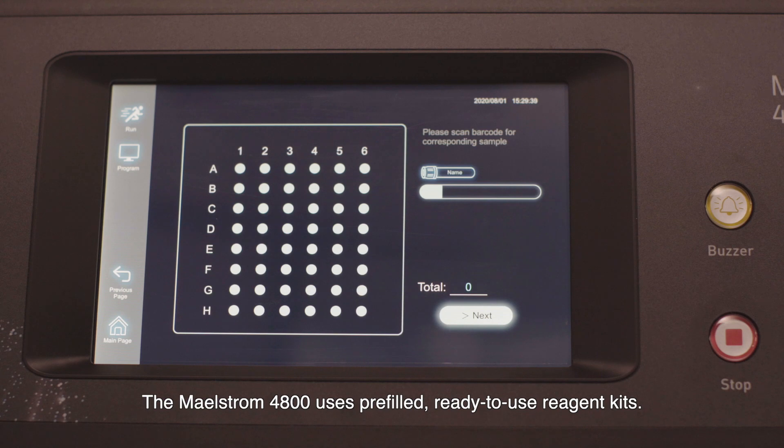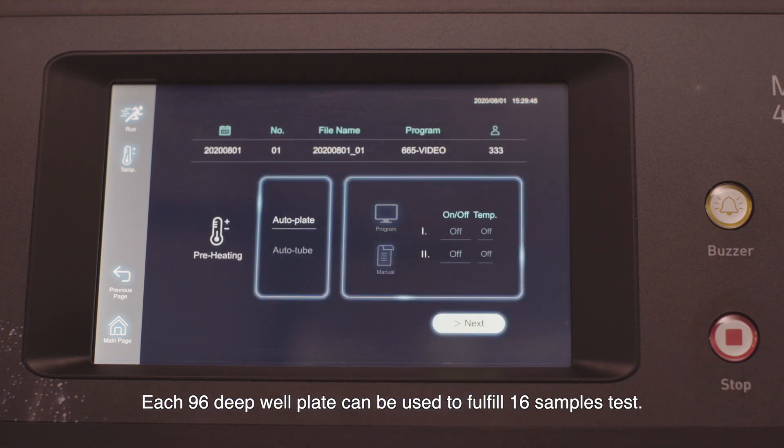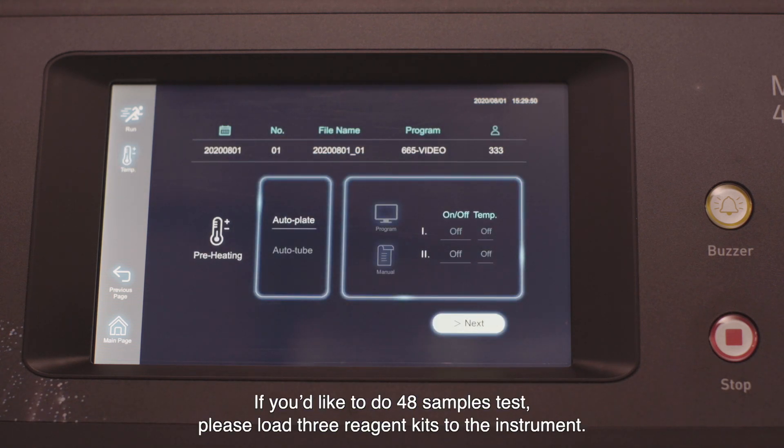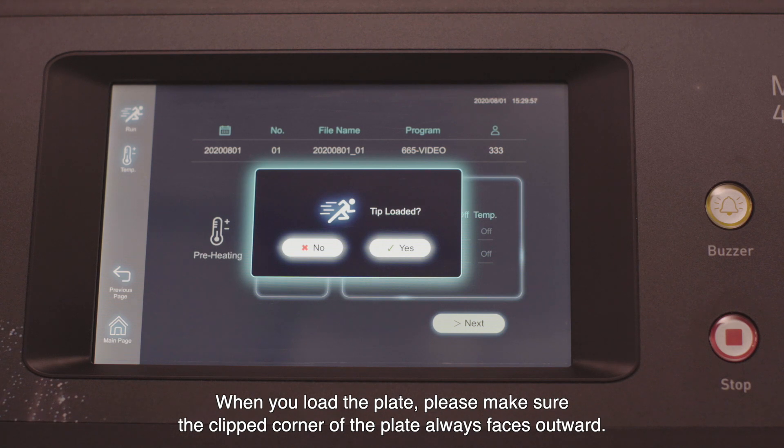The Maelstrom 4800 uses pre-filled ready-to-use reagent kits. Each 96 deep well plate can be used to fulfill 16 samples test. If you'd like to do 48 samples test, please load three reagent kits to the instrument. When you load the plate, please make sure the clipped corner of the plate always faces outward.